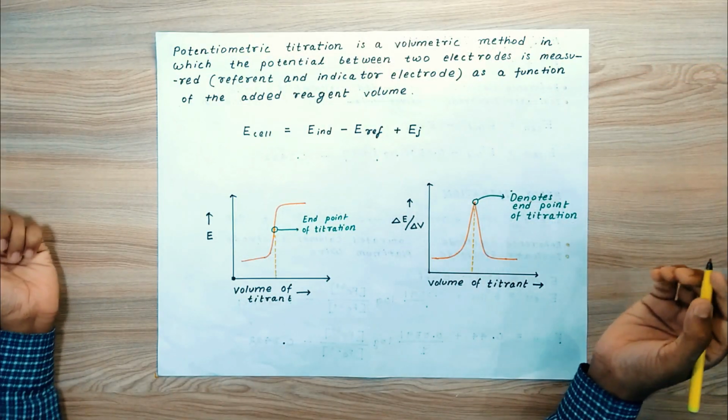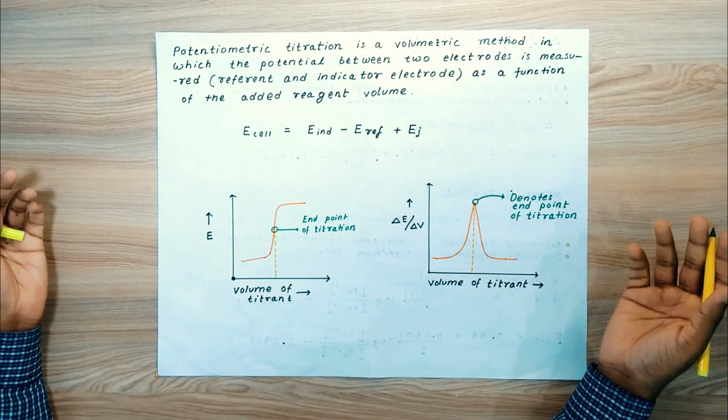So today in this video we're going to learn about potentiometric titration. Before starting the video, a quick context: in this video we are going to discuss the theoretical concept of how we can use a potentiometer to determine the endpoint of a titration. So let's begin.